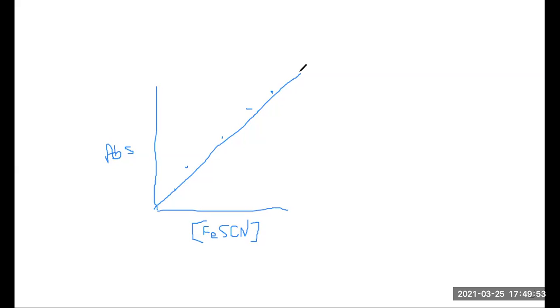If it's under 0.9, double check your math. I tried to make sure I looked at everybody's data before they left for the night on the nights that we did this. I don't remember seeing anybody that had data that looked super glitchy. So you should be able to create your graph and get a pretty decent linear graph out of it.